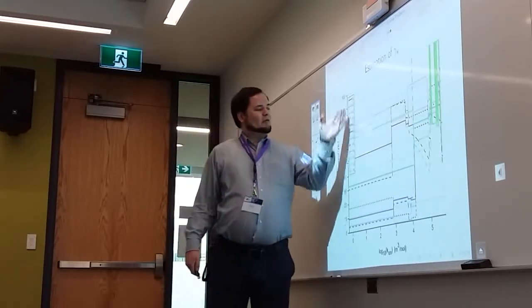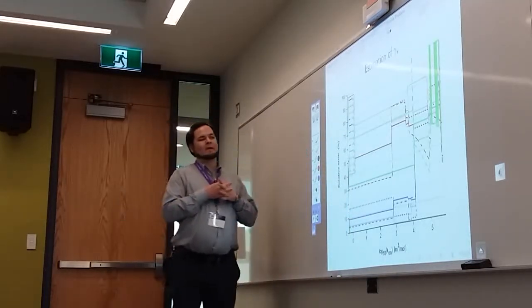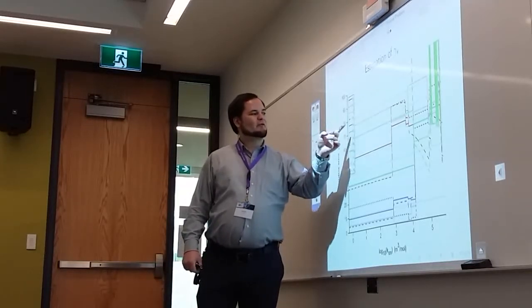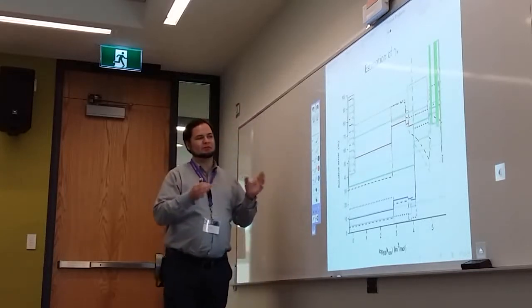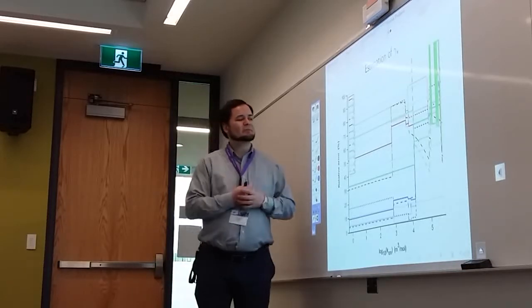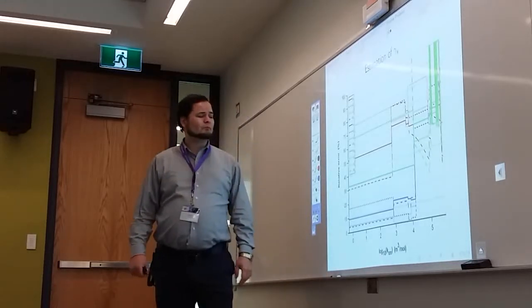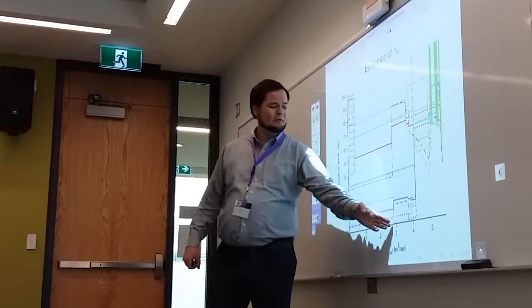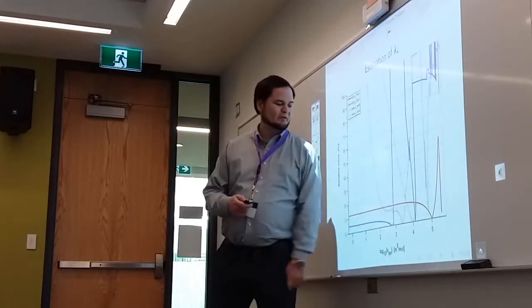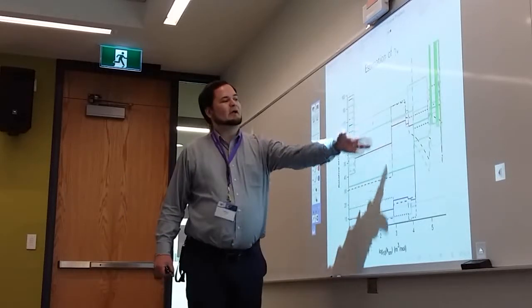Okay, and then these are the gamma parameters. Remember, that was for the initial plug concentration profiles: the center, left and right standard deviation, and the height of each asymmetric Gaussian injected plug into the capillary. Again, we have near constant relative errors up to a certain point. So what is this point actually? That was around 2.85 or something like that, and here again around that point.